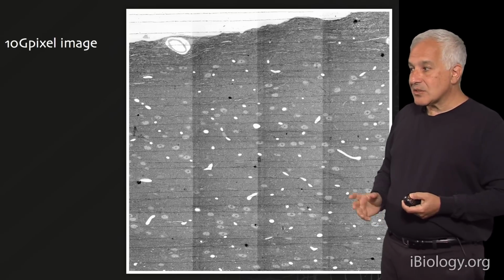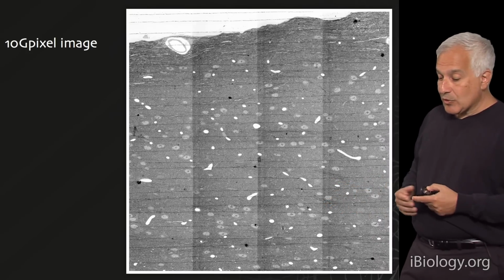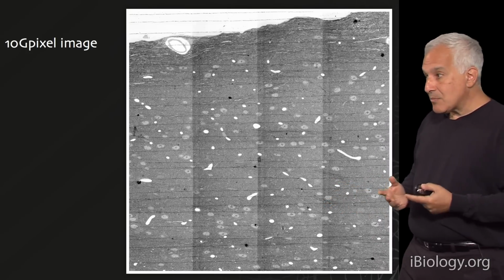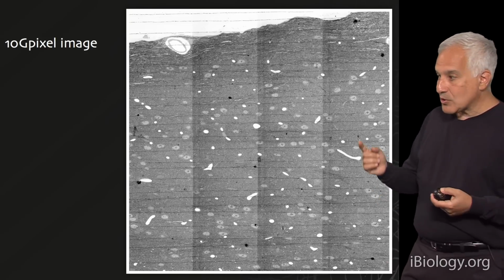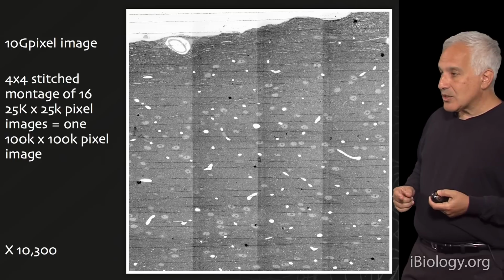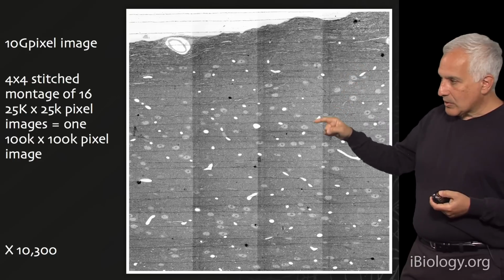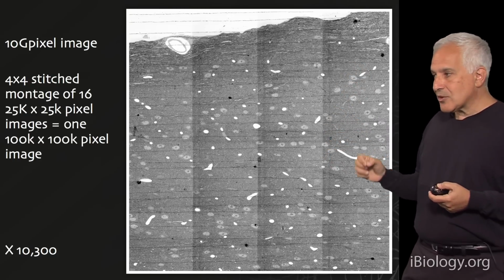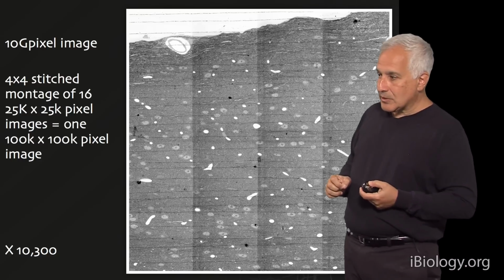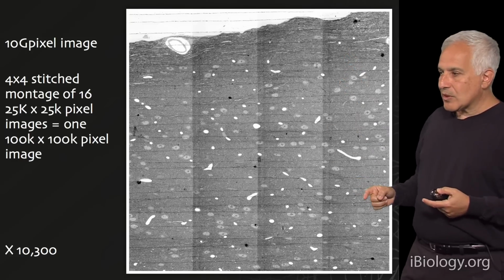This image is a 10 billion pixel image, a 10 gigapixel image. Some of you may have cameras that are 10 megapixel. This is an image that's 1,000 times bigger. So you have to take 1,000 pictures for each of these. And that is because it's a montage of 16 images. That's what these streaks that you see are. It's a 4x4 array of 25,000 by 25,000 pixel images, all knitted together to make this 100,000 by 100,000 image.